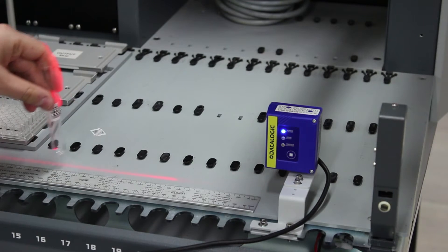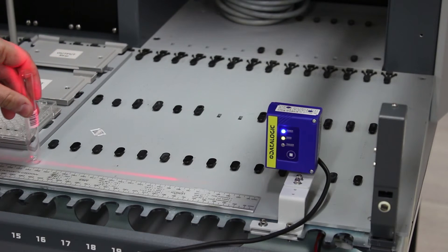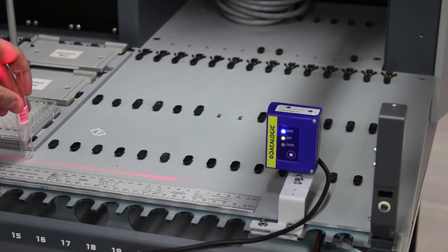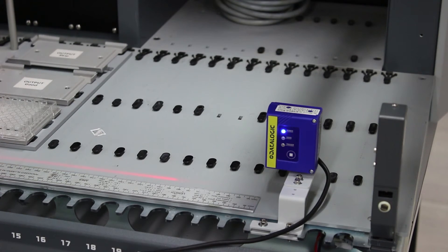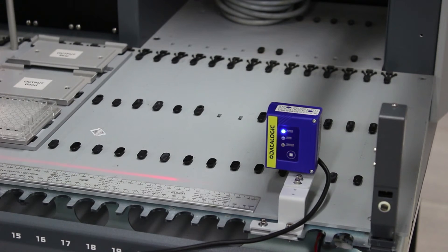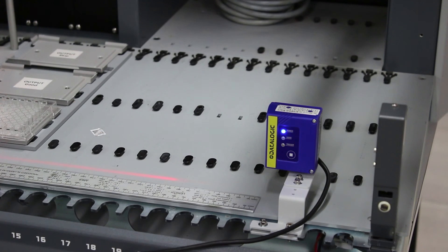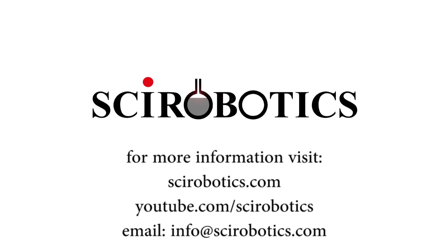The usable range for TubeID is any grid where both sticker barcodes and tube barcodes can be read. In this case, the usable range is between 10 and 36 cm away, or about 10 usable grids.